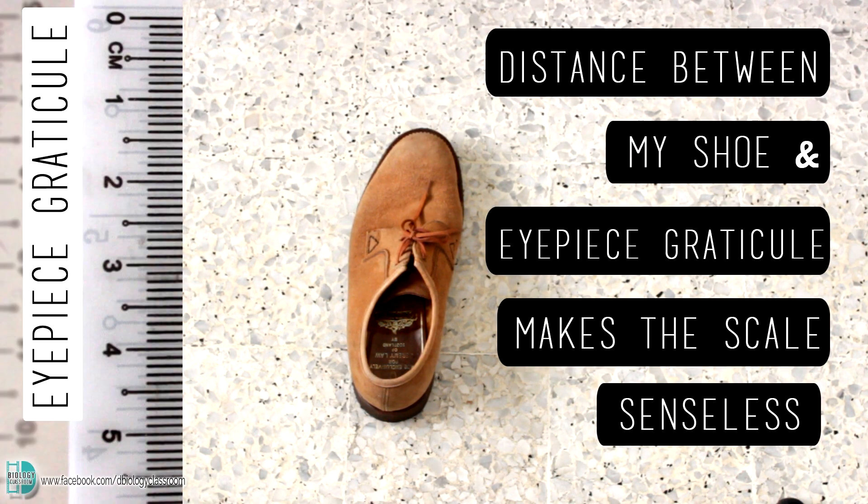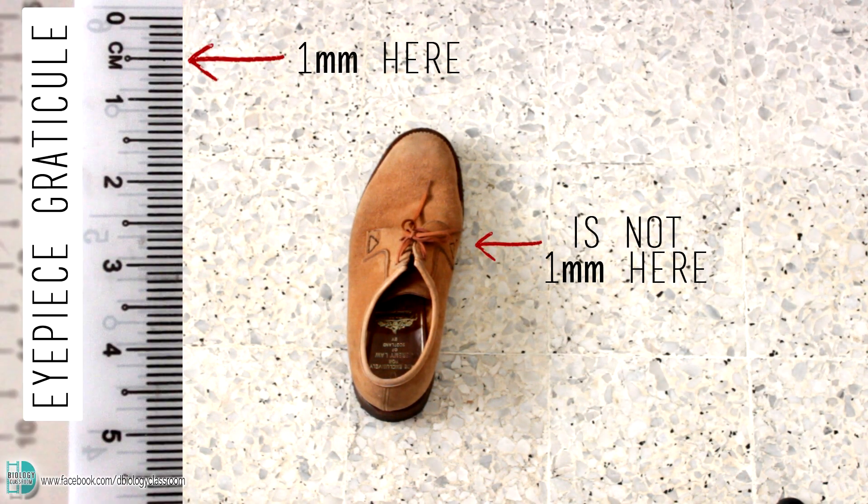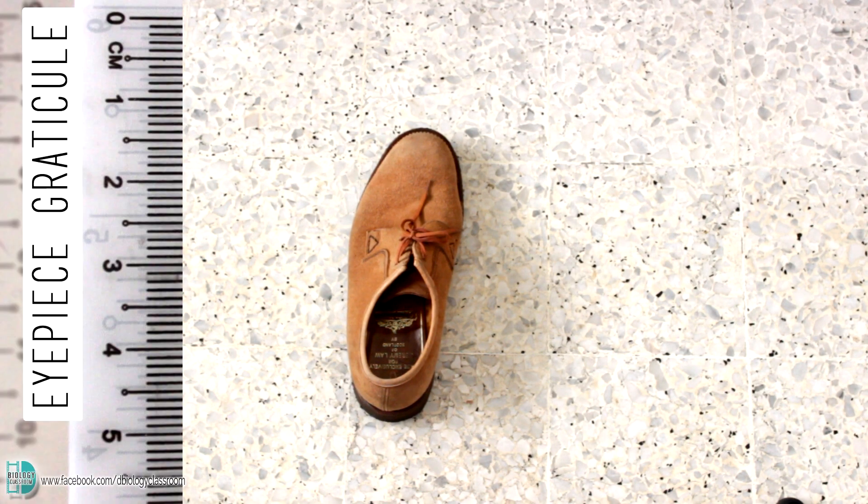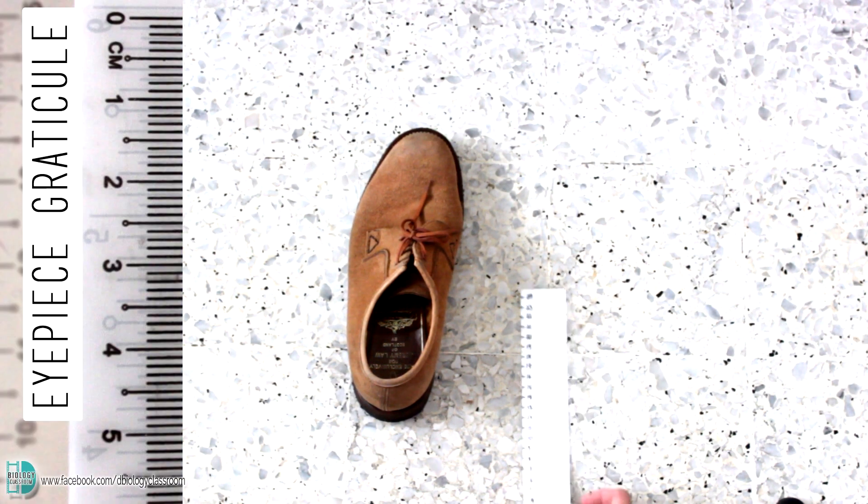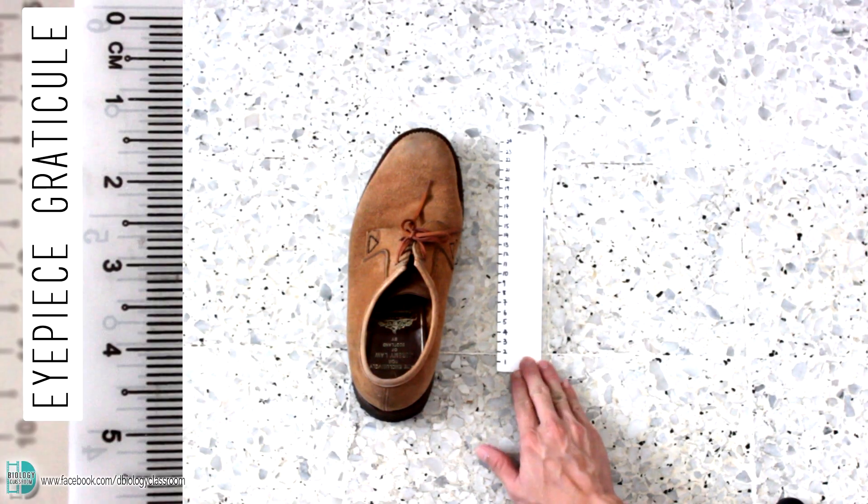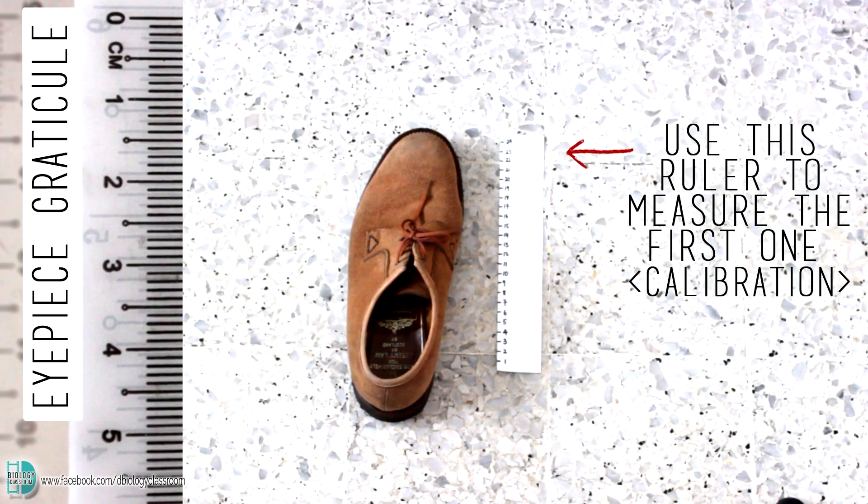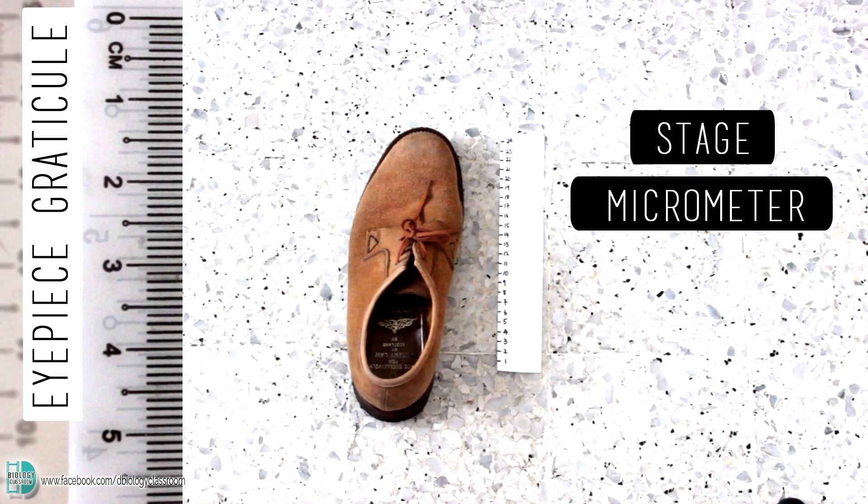The distance between the ruler and the shoe makes the scale on the ruler senseless. 1mm on the ruler is not 1mm on the stage. So if I want to use the scale of this ruler, I must place another ruler at where the shoe is. I can use the second ruler to calibrate the scale on the first ruler. And this second ruler represents the stage micrometer.